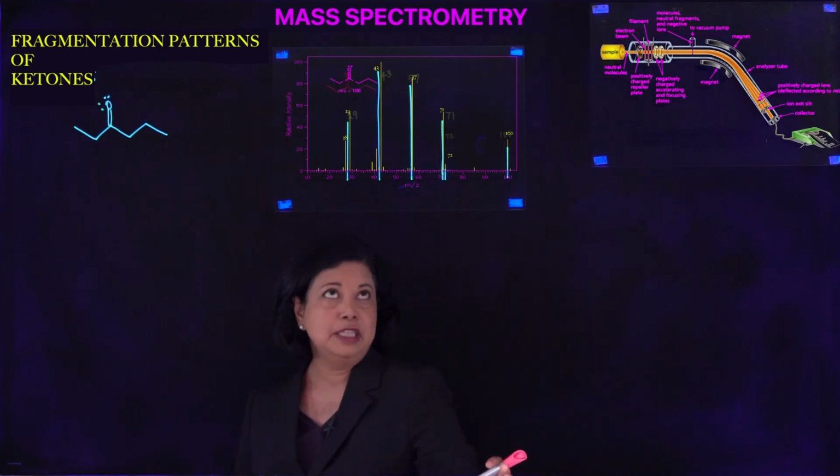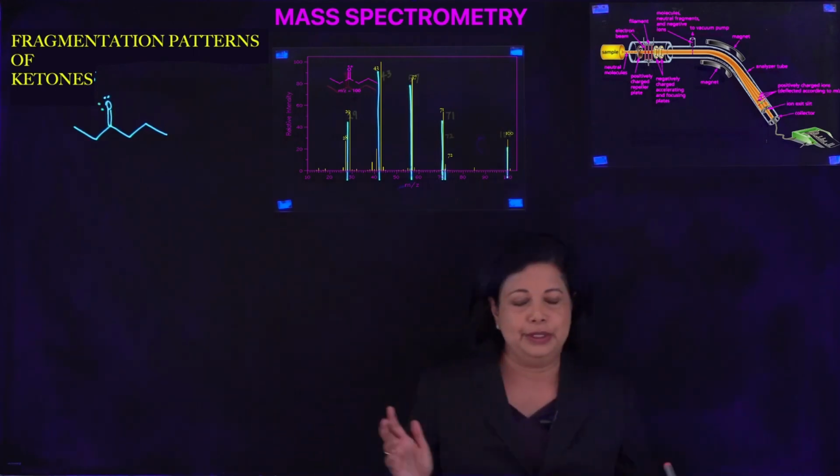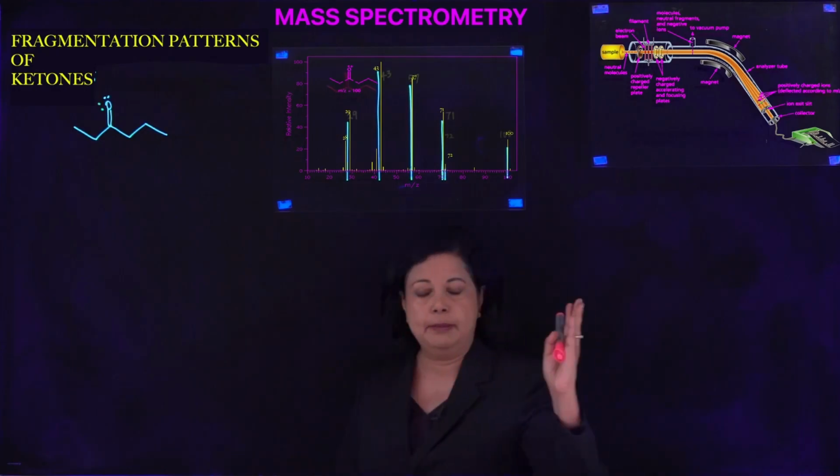Welcome back to Mass Spec. We got a ketone for you today. We'll see how ketones can break up in a mass spec machine.